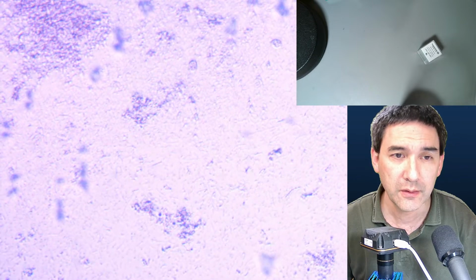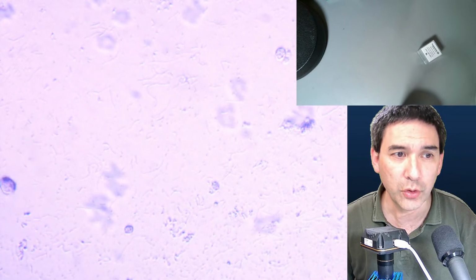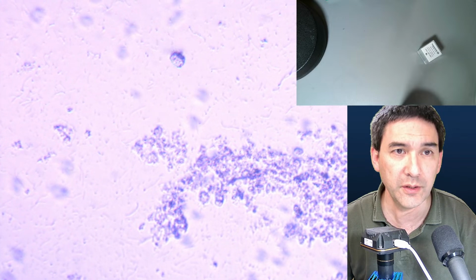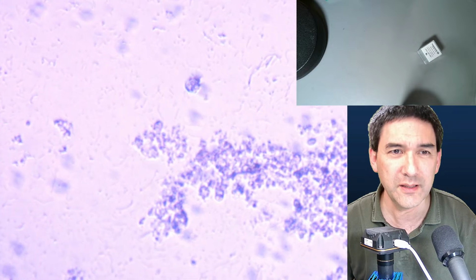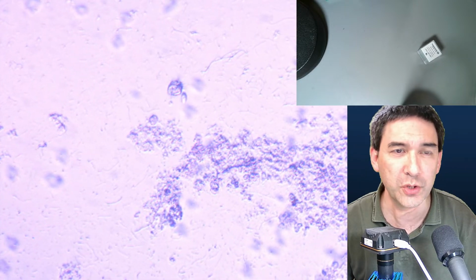Okay. You see the contrast is not particularly good. So what I'm going to do now is switch over. I saw something. There was one. Oh, there's another one here. Oh, there are a couple here. Just a few days ago the concentration of microorganisms was much higher.